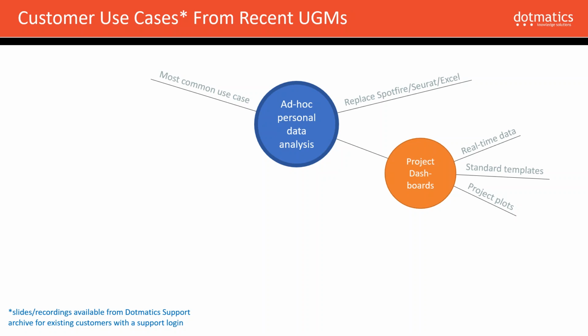So they're simple enough to build that you can build specific projects, specific templates that address the concerns of specific projects. An extension of that, which has been talked about, is also using this then with CROs. So these dashboards can be used internally equally with the right infrastructure. They can also be shared so that scientists in collaborations that cross companies can also see the same dashboards of data while making project decisions.